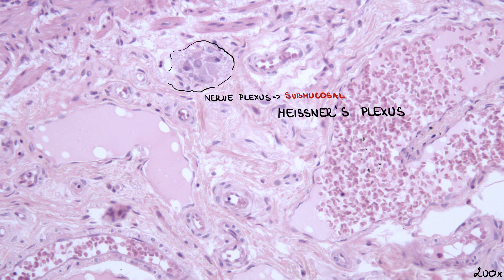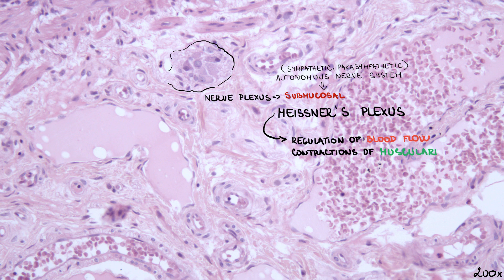This plexus is controlled by the autonomic nervous system — both sympathetic and parasympathetic — and plays a role in regulation of blood flow to the submucosa and mucosa, contractions of the muscularis mucosae, and in secretion of various substances. We can see some ganglionic neurons here.